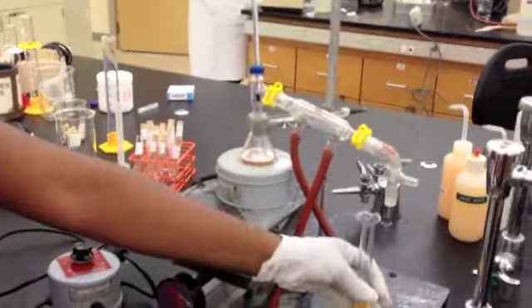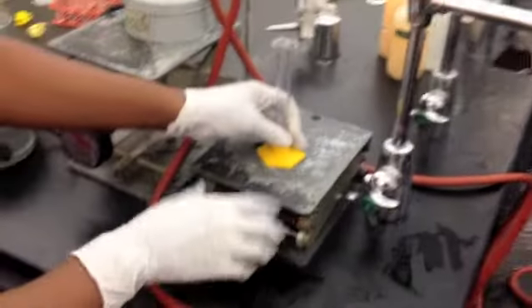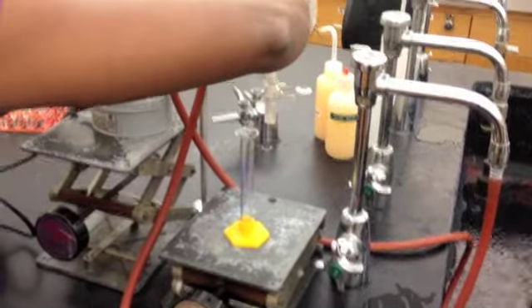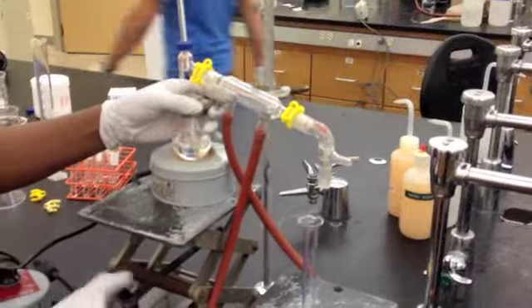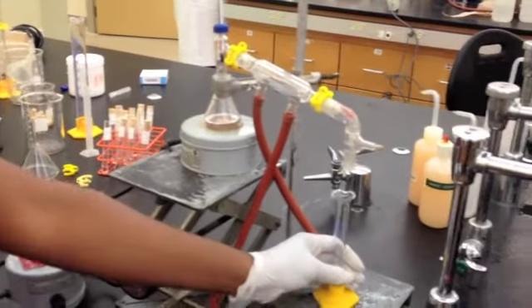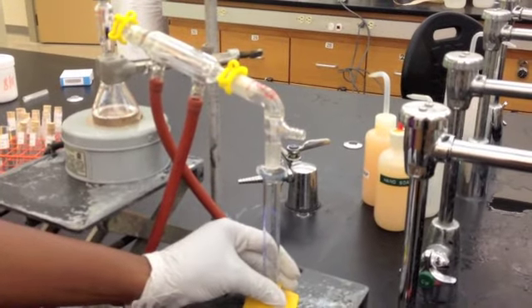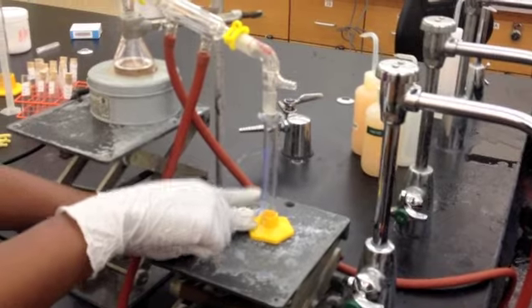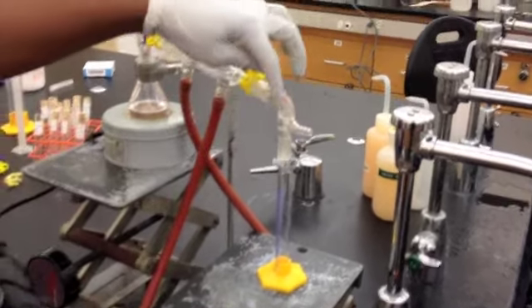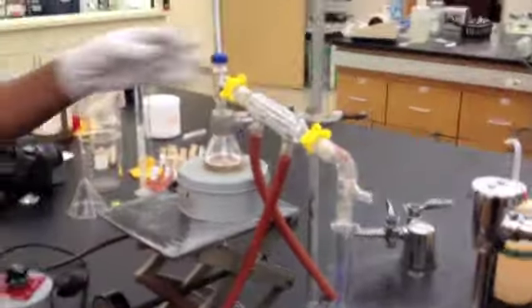Once you've set up your apparatus and you have your heating mantle on, make sure that everything is able to fit. I'll make a small adjustment here, and I'll raise my jack so that the condenser is right. I have a 10 mL graduated cylinder that I'm going to use to make the volume measurements right below the tip of the condenser. And now I'm pretty much ready to start the experiment.